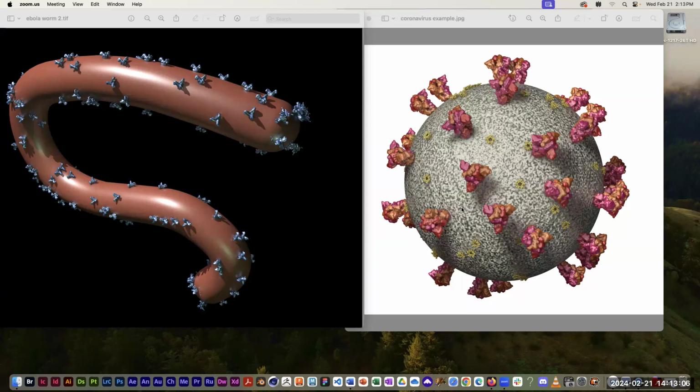So I'll introduce Chimera X. It's quite simple. It allows you to open the Cryo-ET data and apply a couple of little filters to it, and then export it as a 3D model, as an STL file, very similar to what we did in the segmentation exercise on Monday, where we exported images from Horos as an STL file.